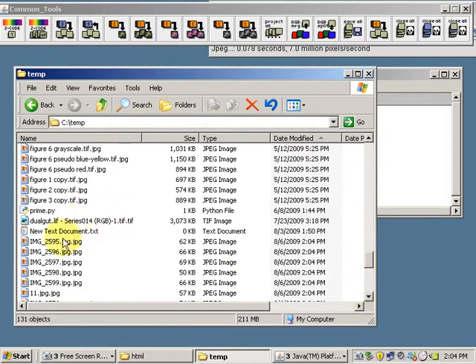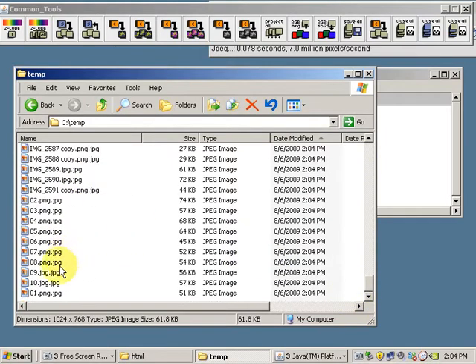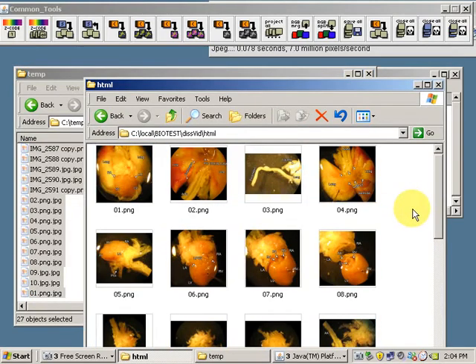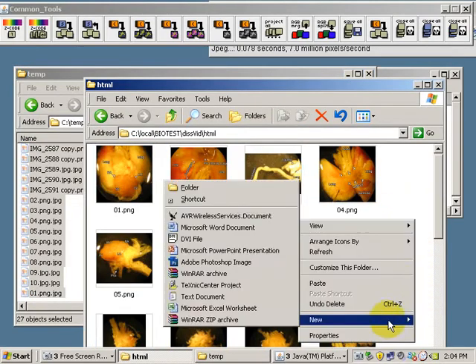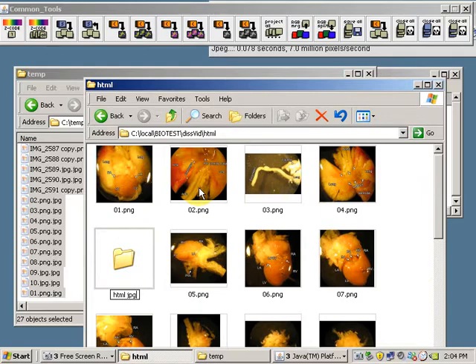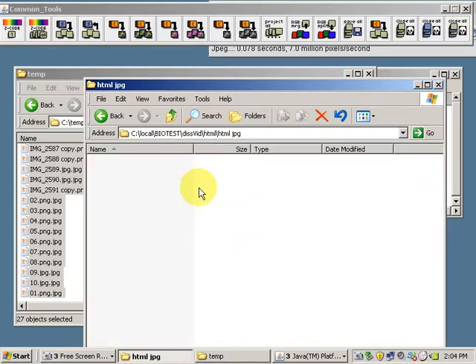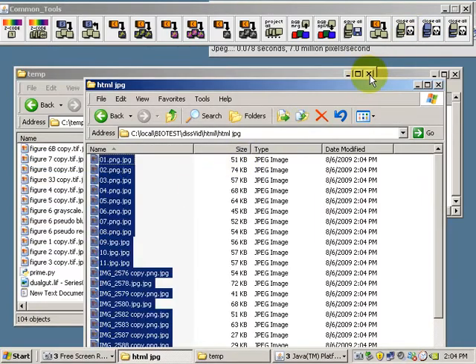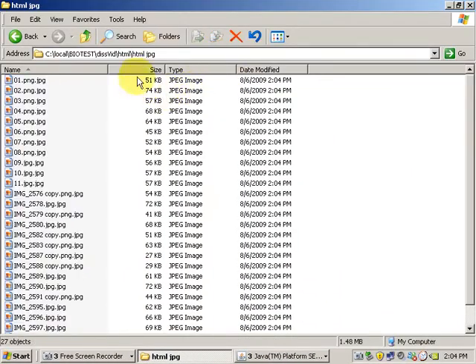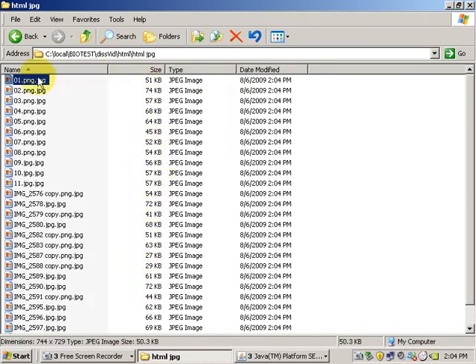I'll cut them. Make a new folder here. Paste them. And here we go. Our file sizes are a lot smaller. They're in the 50 or 60 kilobyte range. Whereas before, they were in the 400 and 500 kilobyte range. And the quality is still there.